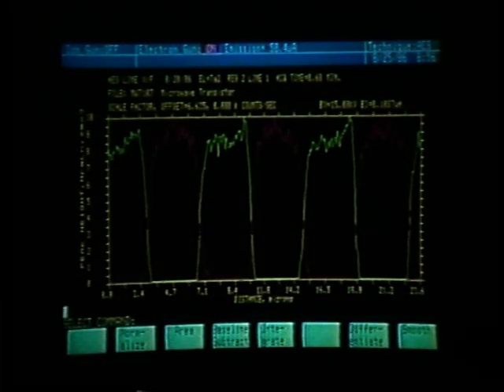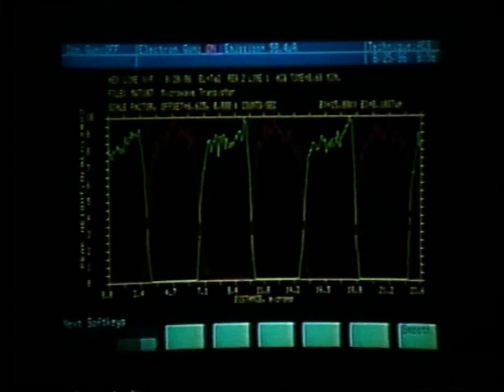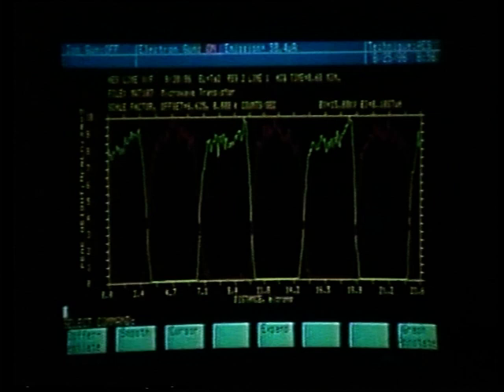We need to then enter the graph annotate mode, pressing the next key, which is function key number 23. We see our next data bank, which allows us to graph annotate, soft key number 8.